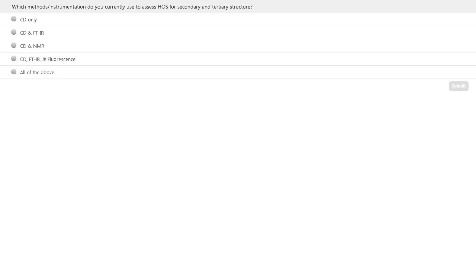What sort of results are you expecting to see from this, Mark? Thanks, Joe. Again, I'm quite interested to see what the audience does at the moment, and whether it sticks to, if you like, what the Q6 regulations say with regard to just using CD and FTIR, or CD and NMR, or whether they're actually looking at using whatever techniques are available or appropriate to understand which is the best. So it's trying to gauge what the audience currently see as their mainstays.